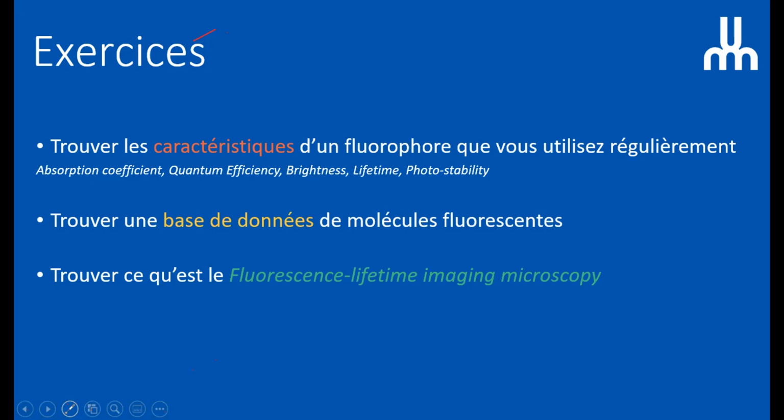What it means is that if I receive 100 photons, the FITC is going to emit only 27 photons. So I lose a lot of light. Is FITC good? Not so much. Now the other question is, what is the absorption coefficient of FITC? It's here. It's 78,000. Nice.